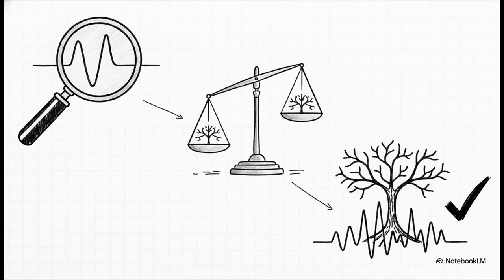To successfully pull this off in your own analysis, you definitely want to follow a few key rules. First up, always start with the absolute simplest pattern in your spectrum so you can extract your initial J values easily. Second, check for internal consistency. This is huge. If proton A splits proton B by 5 Hertz, then proton B absolutely must split proton A by exactly 5 Hertz. The coupling constants have to match perfectly across the molecule. And finally, once you've extracted most of your constants, use them to mathematically predict the tree diagram of the final, most complex pattern. If your prediction matches the visual spectrum, boom, your structural analysis is completely correct.